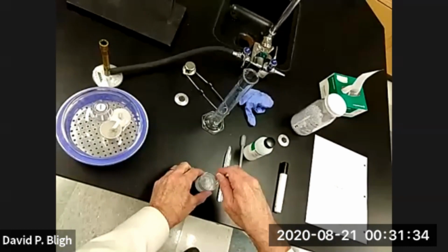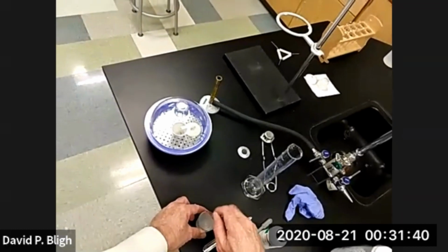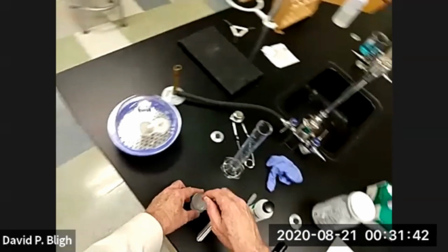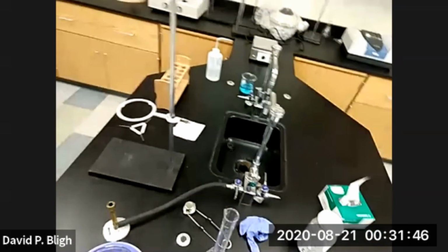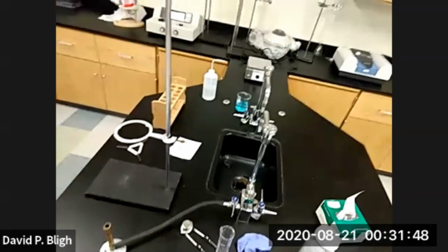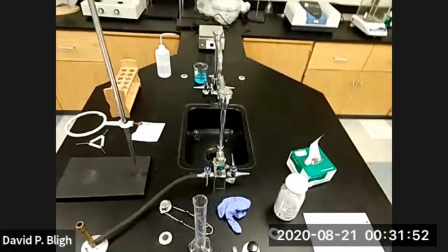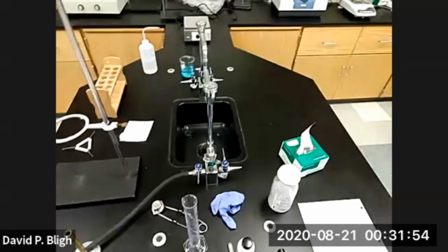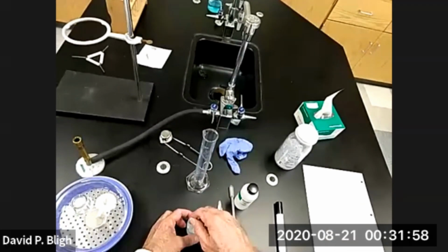Now, the one thing about sodium carbonate and sodium oxide is they are both water soluble. When we get to the discussion of solubilities, we'll find that anything that's combined with sodium, a sodium salt like sodium carbonate, sodium bicarbonate, sodium oxide, sodium chloride, any sodium compound like that, is soluble.